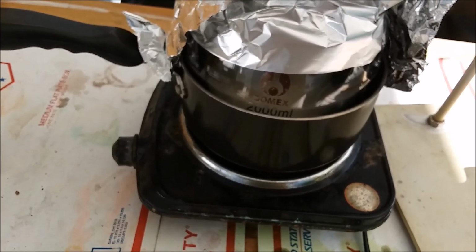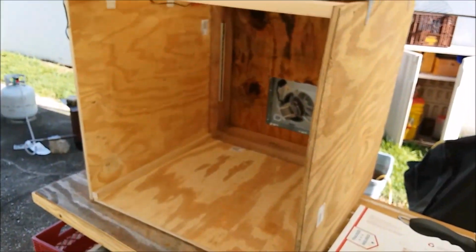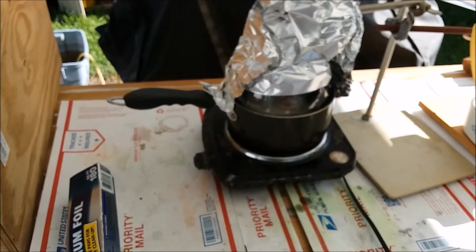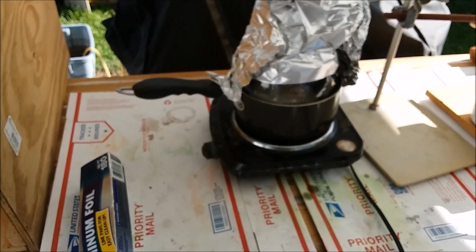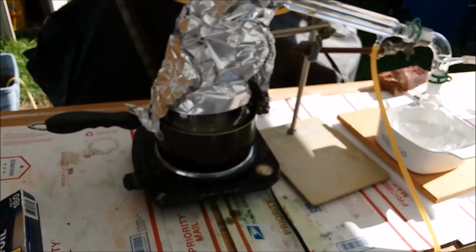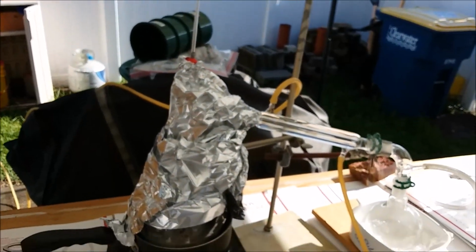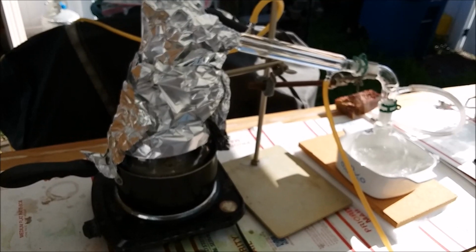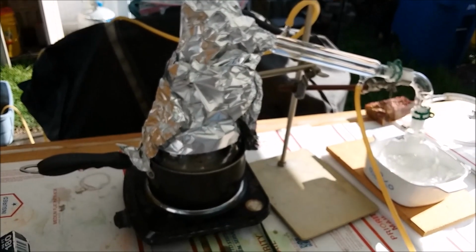I'm going to go get my painting supplies together and start painting the inside of the fume hood while this is going on. And in the future, I'll be able to do reactions like this inside a fume hood. Won't have to deal with stinky issues like the nitrogen dioxide gas.